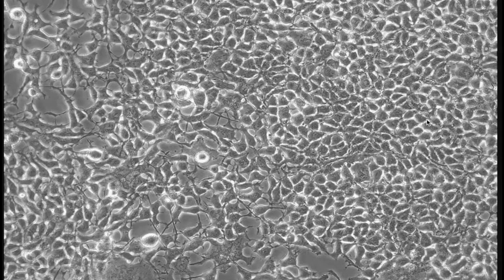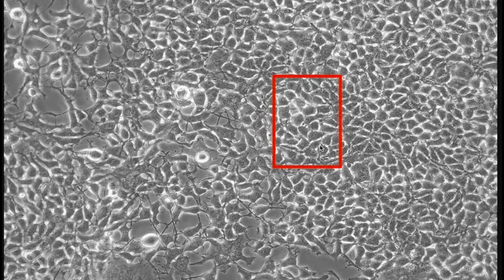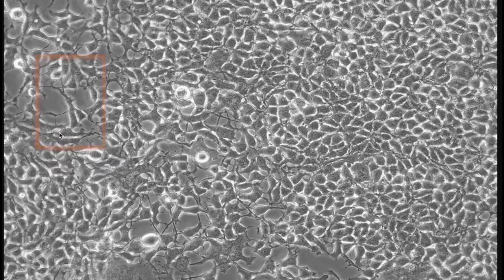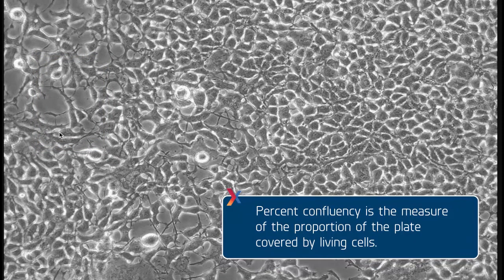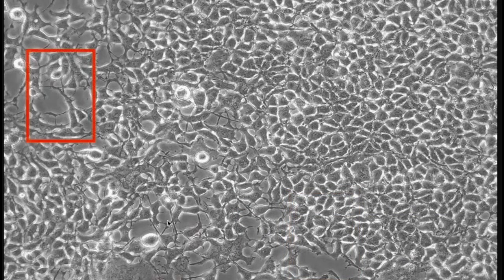Looking at these cells, they appear to be about 90 to 95% confluent. Basically what I'm looking at here is this area over here is all growing cells and these areas here and here are areas of the plate where cells are not yet growing. Percent confluency is just a measure of the proportion of the plate covered by living cells, which in this case, judging by only the few areas of empty plate, is about 90 to 95 percent.